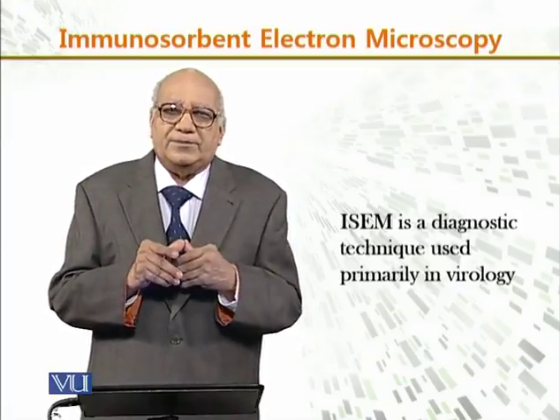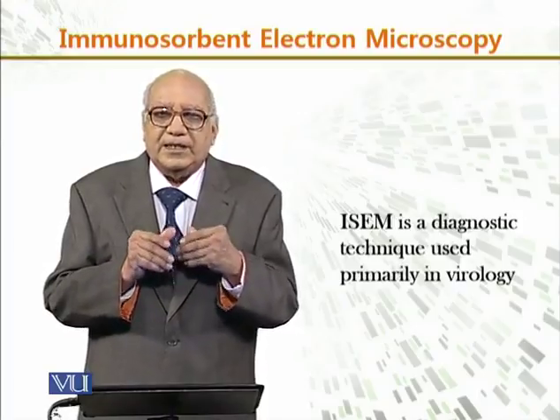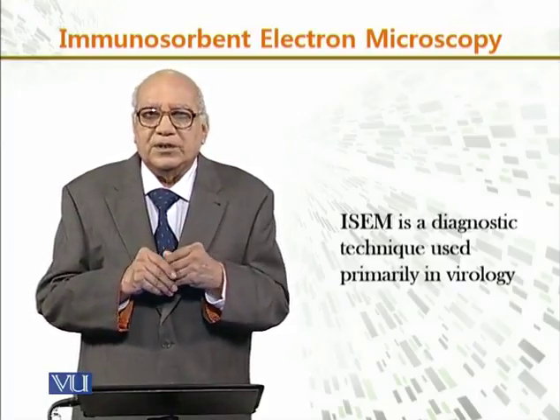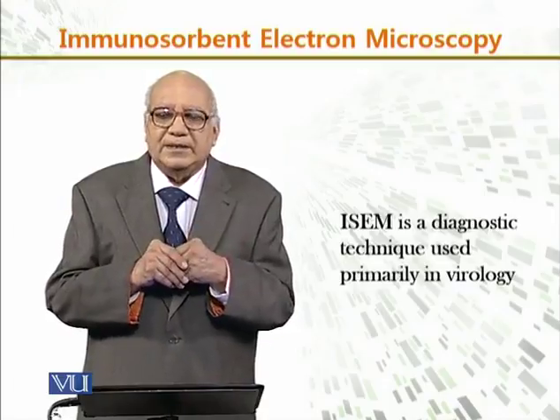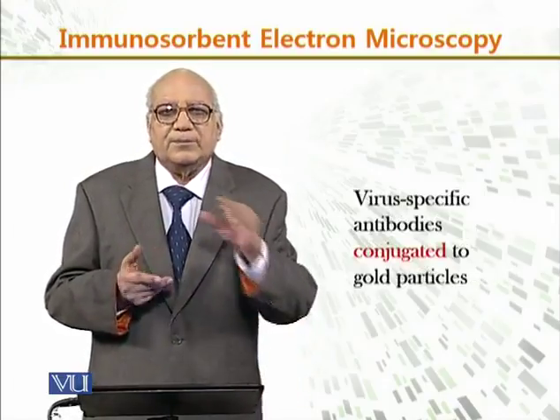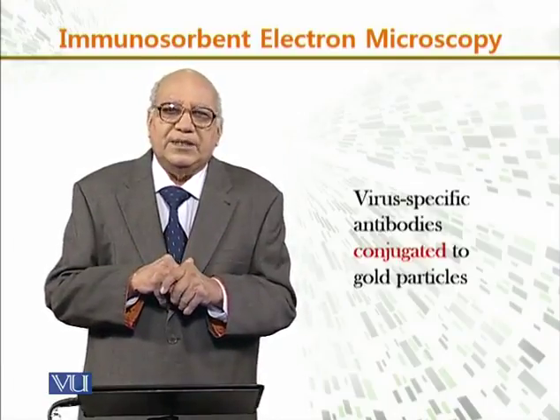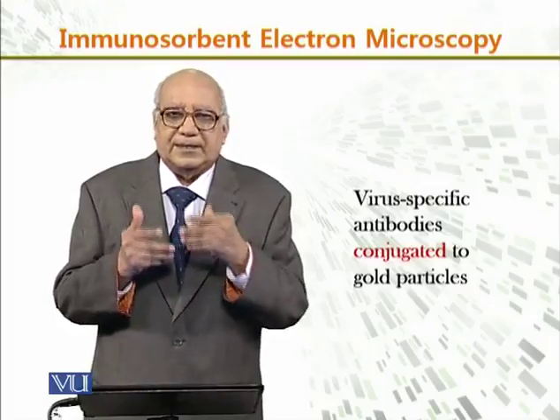But with the help of ISEM, we can diagnose, we can identify the different viruses which are present, or the virus-specific antibodies which are there.